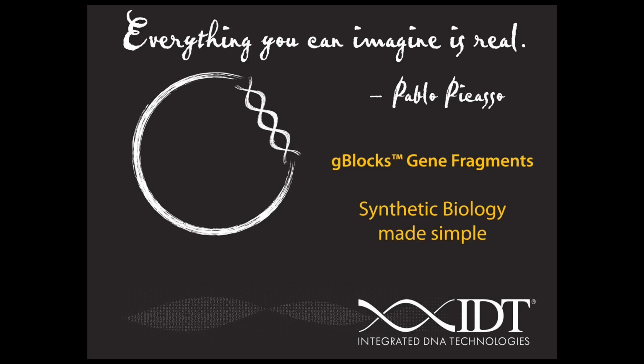So if they do go through the website and they run into an issue with a particular sequence being rejected, at what point should they contact the support group? Should they contact you guys immediately? I think for some of our customers, we do provide information about why individual sequences are rejected. For instance, we'll indicate where repeat regions are or regions of high GC content that are particularly problematic for us. And so the customer can take that, and if they have flexibility in changing their sequence, they can look through that and make changes themselves.